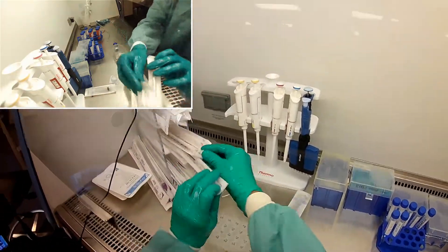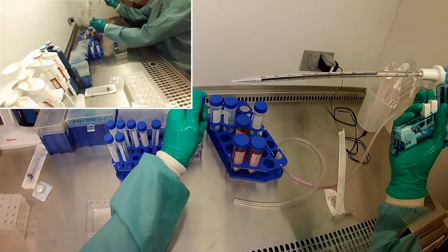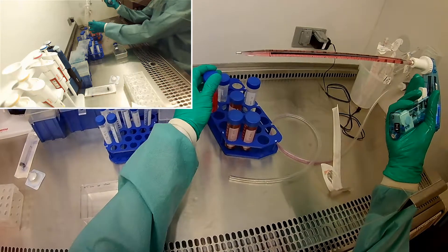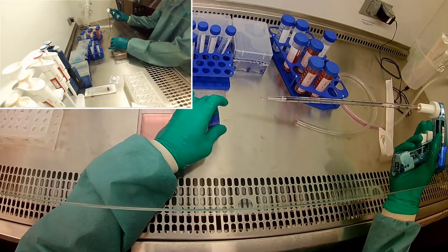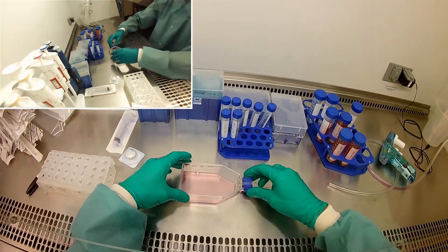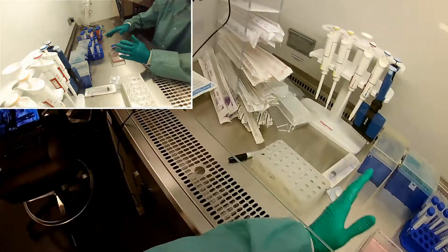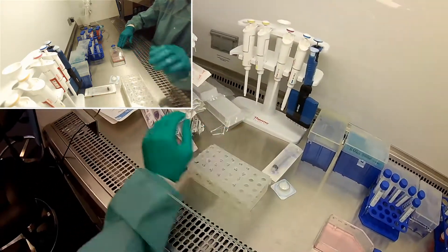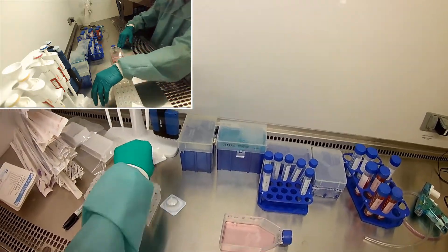So I'm going to go ahead and prepare my flask while we're waiting for the cells to come off. Go ahead and put some media in there. So while we're here, I already did all my calculations. I know how to do everything, and this is really important. I have my lab notebook all set up and ready. I did all the math. All I need to know is how many cells — I already know how many cells I need for my well plates. I already know how much of each chemical I need when I mix chemicals. So it's really important to go ahead and get that stuff done ahead of time.